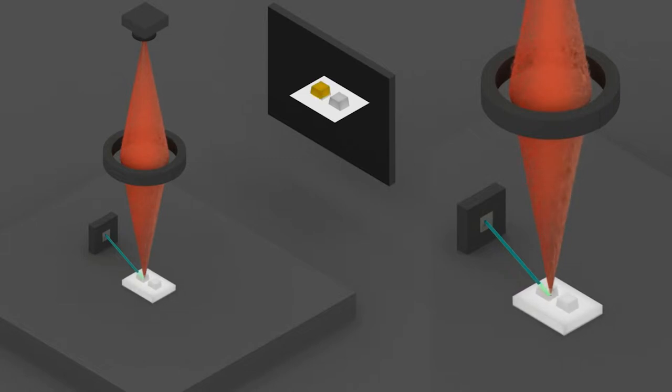In practice, the size of the focused electron beam can be a nanometer, which is several hundred times smaller than that of visible light wavelength. Hence, the SEM allows for a much higher resolution and the observation of much smaller objects.